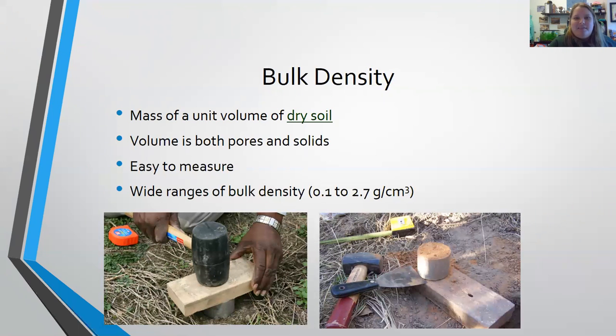So there's this whole method of putting lots of cores together, putting a ton of peat in it and tapping it gently, and then taking the middle core out, and that would be packed at about the same relative density as plants growing in the greenhouse.